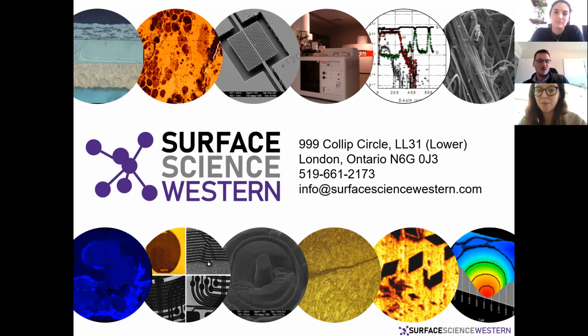We had that trouble with europium, where we were trying to figure out whether it was europium 2 or europium 3, and it has odd structure. I know lanthanum and cerium all have these big peak shapes, and you have to go through and do what I've done with nickel and chromium, and make peak fitting parameters. I probably have some of them saved in my files, but it's the same sort of system where you've got to run standard spectra on the instrument that you're on, at the same sort of settings.